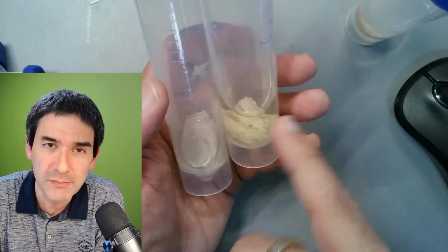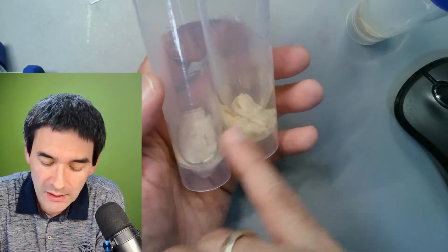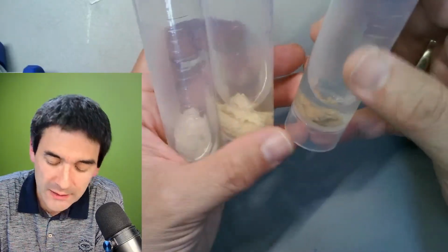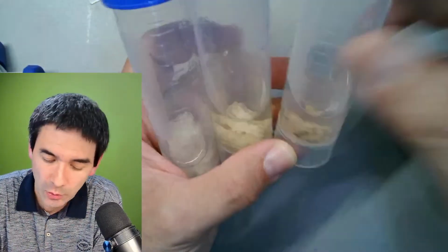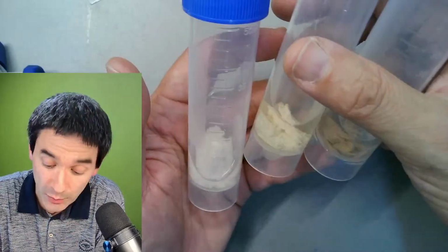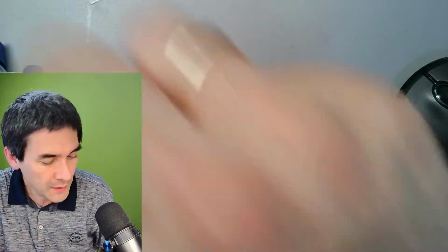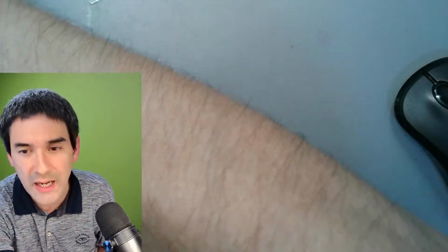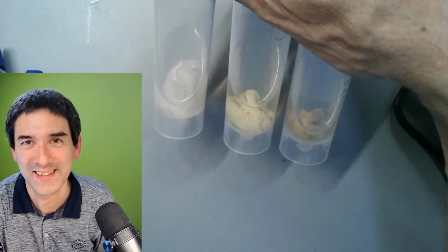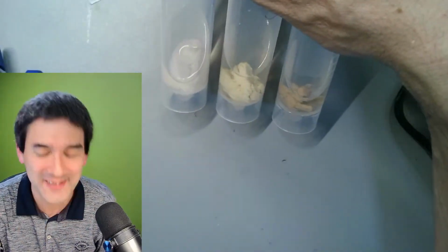Because of course there's water in there, after a couple of days I exchanged the alcohol and added fresh alcohol. So this has basically been stored like this for a year now. If we want to observe it under the microscope, it's always a good idea to rehydrate it. But where is the label?